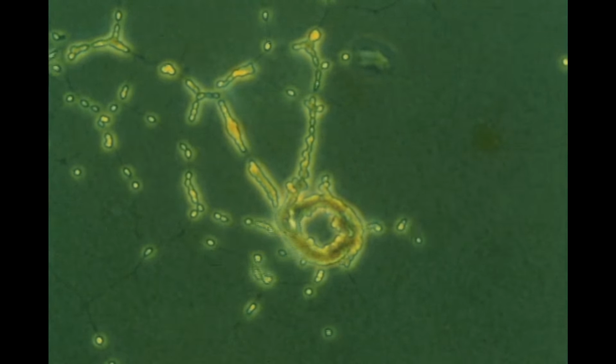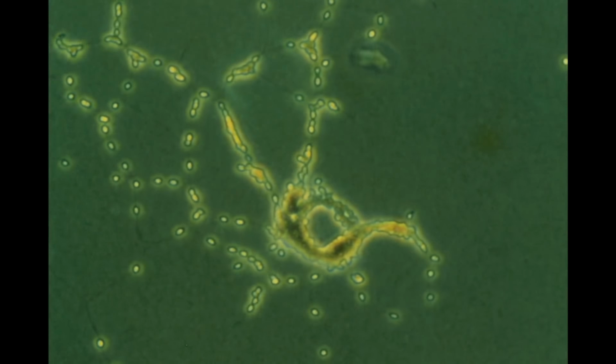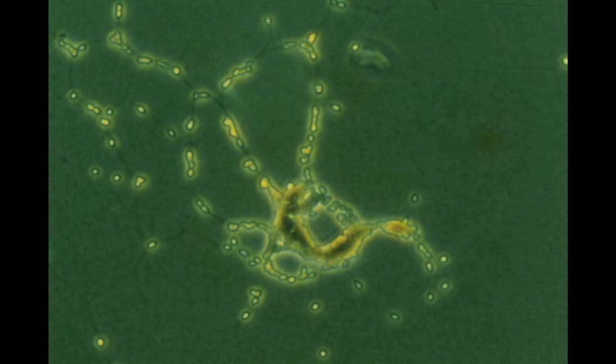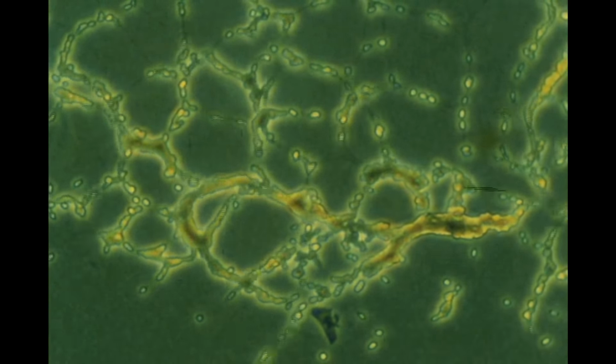Many cells will aggregate in the older parts of the colony, but these aggregations lead only to poorly defined encystment structures. Cell movement in an expanding colony is generally along roughly radial strands.